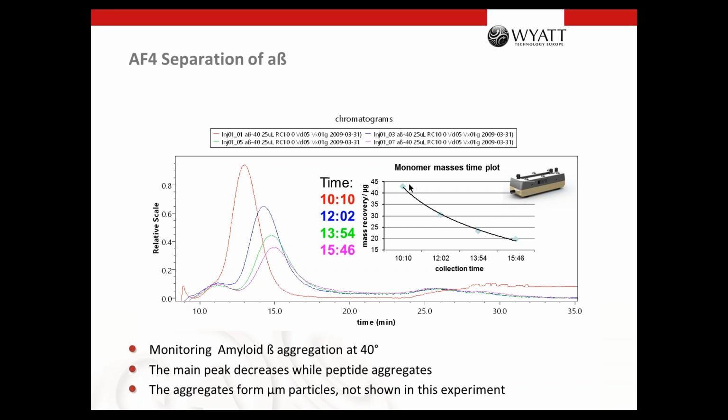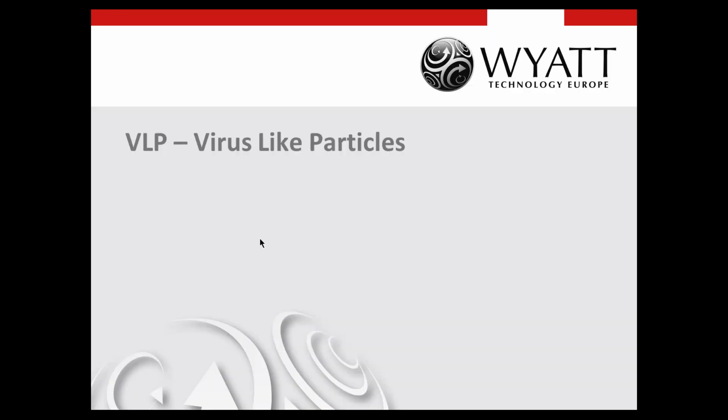And if you plot this here, you can calculate from this a very nice kinetic. And you see the fit is quite reasonable. With this aggregation, very big particles are built that you cannot separate anymore because they are bigger than 1 micrometer, and maybe they precipitate in the vial, so we couldn't see them. But you see very nicely the decrease of the area of the main peak.